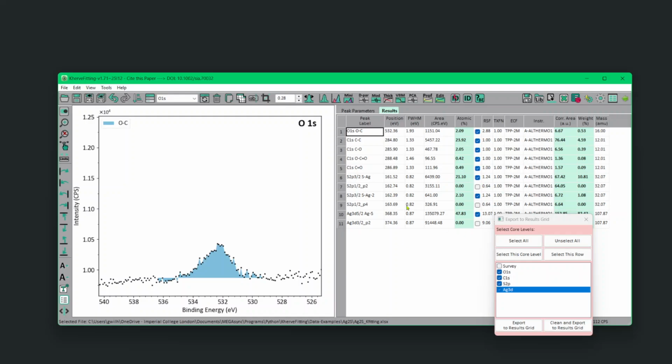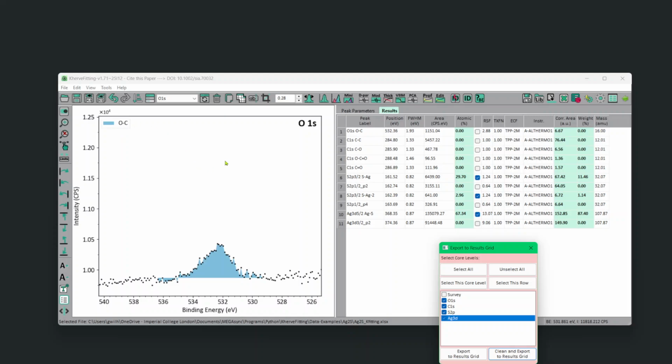So now you can look at all of them. So let's just untick the carbon 1s because it's a bit easier for us to understand our ratio. But what we get here is 67. And so that means, because we have three atoms, two silver and one S, that means yeah, 3. So that's exactly what you expect. So 33 to 66.67 or 67 here. So it's a very good affirmation that we have silver 2S in here.